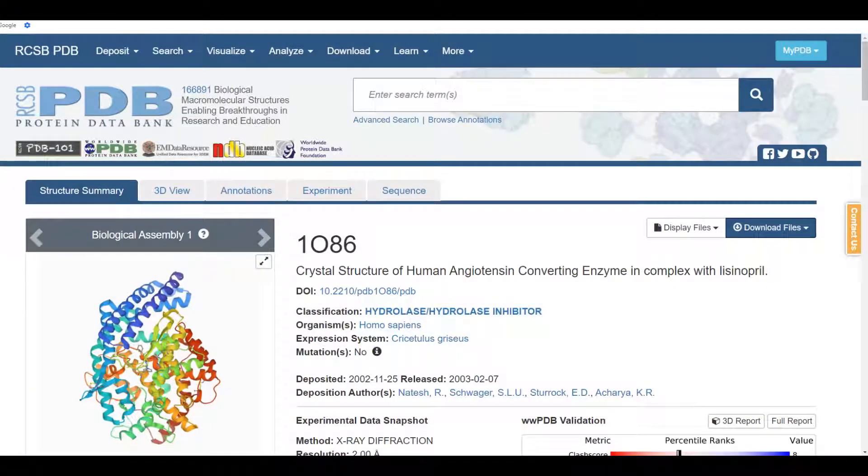We're looking at the webpage for PDB entry 1O86, and that O is a letter O, not a zero. This protein is angiotensin-converting enzyme, or ACE.